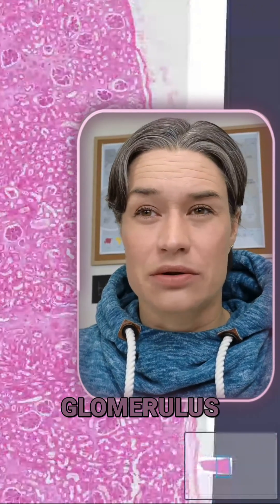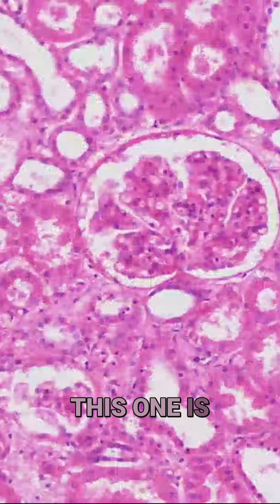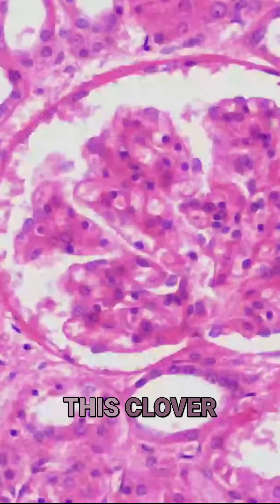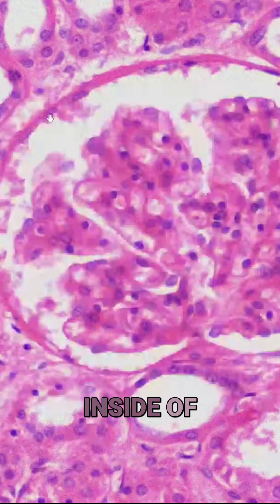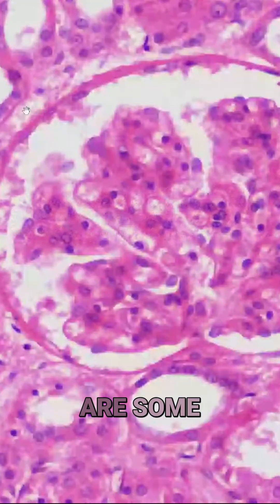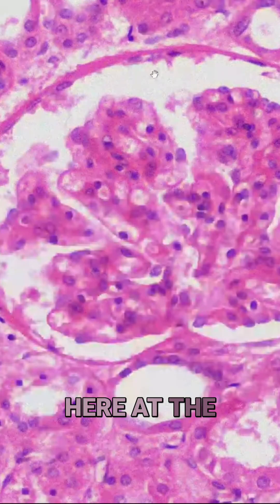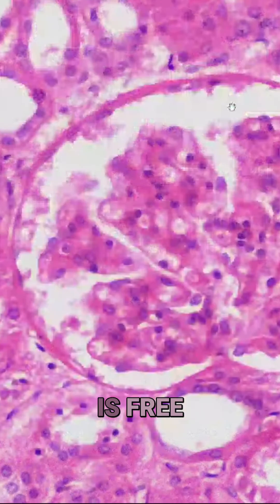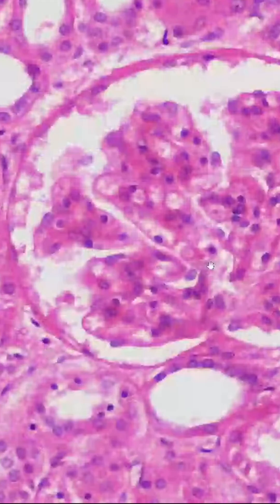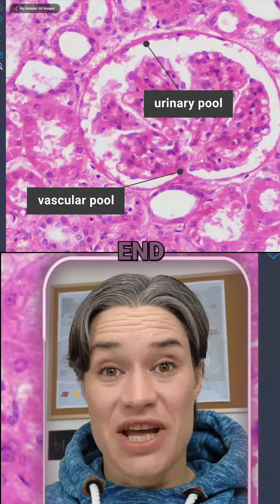Taking a closer look at the glomerulus, we can find a beautiful one here. It is like a clover flower inside some white space, surrounded by a membrane. There are some cells on this membrane. On one end at the top, the glomerulus is free, and that free end is called the urinary pole. The attached end at the bottom is called the vascular pole.